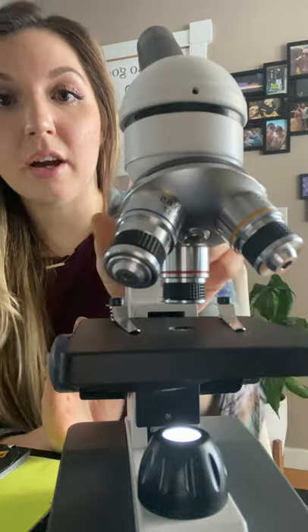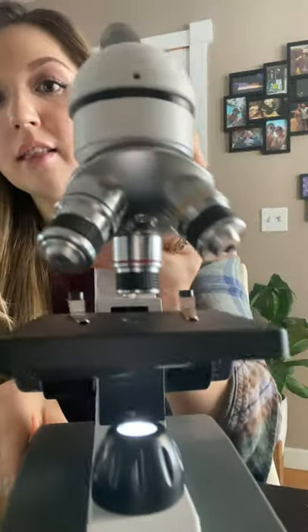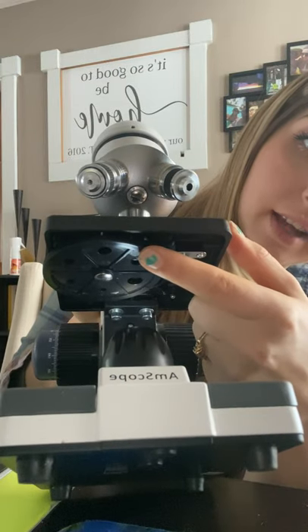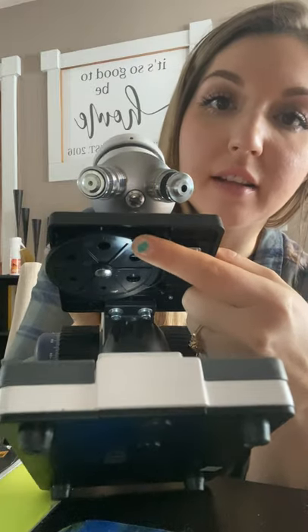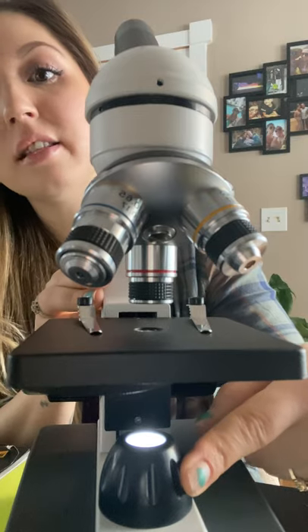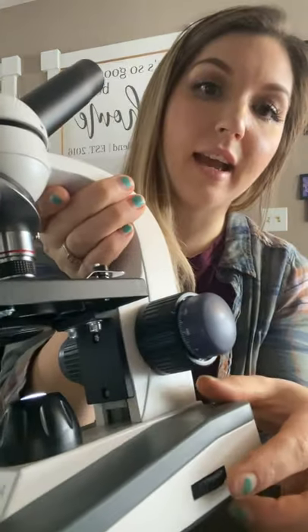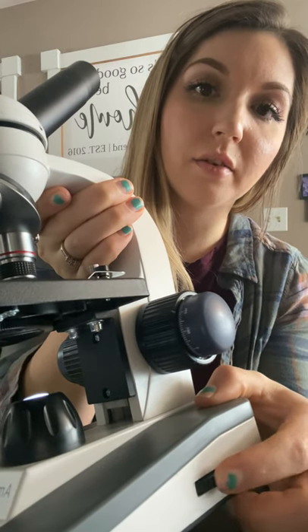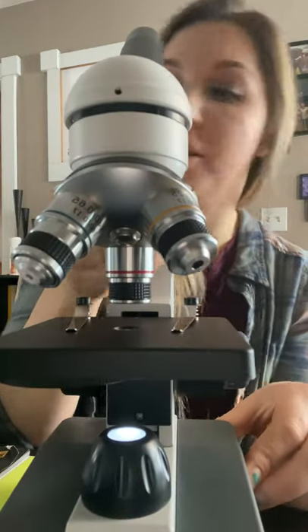Next we have the arm which is right here as I showed in the beginning. Then we have the iris diaphragm right under here, and the iris diaphragm size control right here. This is our condenser lens — it's going to bring the light in. Right over here on the side we have a dimmer switch so you can brighten and dim the light depending on your preferences.